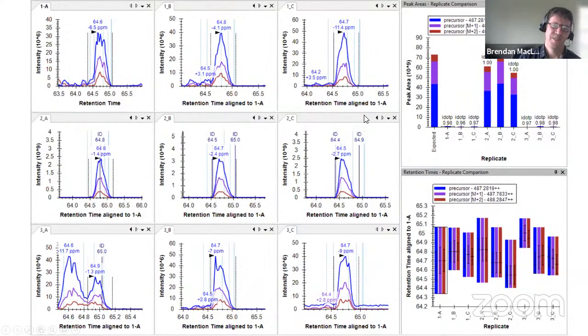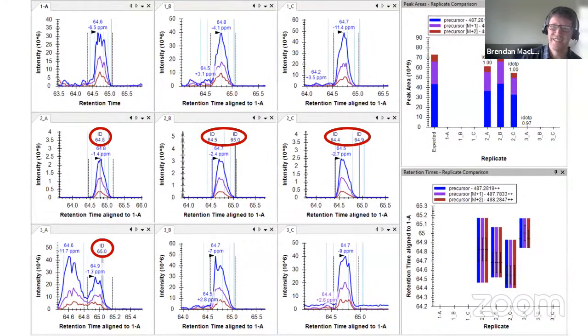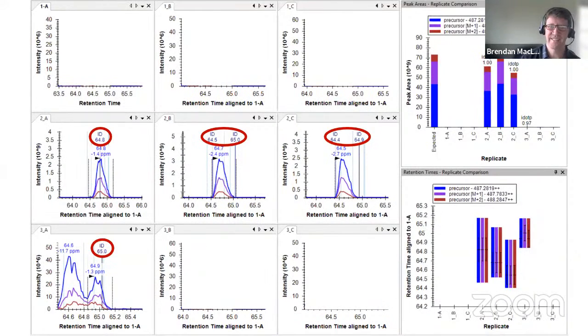And so in the experiment I just mentioned, Bruder treated anything that didn't have a direct ID, so no cross-run alignment, as if it were missing. So I think that's a little bit overstating the problem. We can do better than that with MSMS, but still, the point remains that with DIA, we do get much better coverage and much more selective and better peak areas.